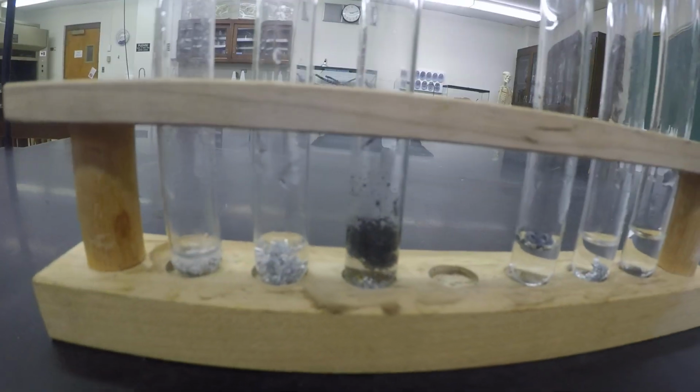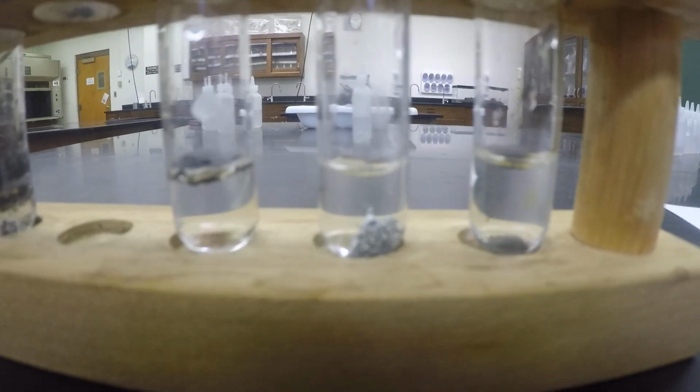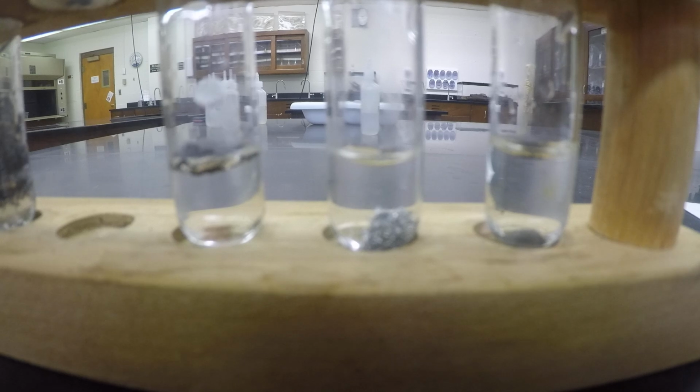Alright, so we have HCl with metals, which are obviously reacting. And we have potassium hydroxide with metals. It is not doing anything. Okay.